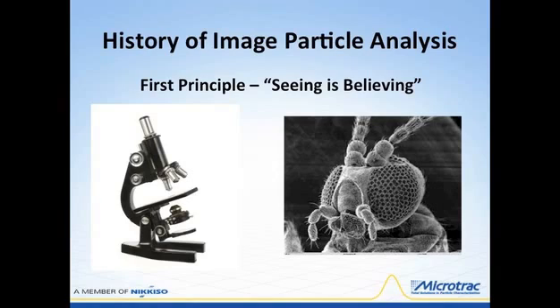Fortunately, today, with the advent of very high-speed digital cameras, high-speed strobe lights, rapid CPUs, and ever-increasing mass data storage, this old static image analysis method has been converted into automated instruments dynamically flowing hundreds of particles per second through a sensing zone where digital images of them get stored and upwards of 30 different size and shape parameters calculated and reported in usually less than a minute. And if that critter on the right gets into the sample, he can be filtered out with the software.